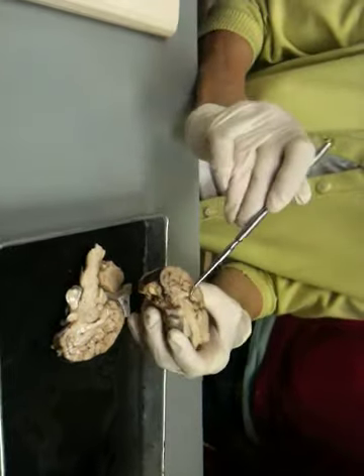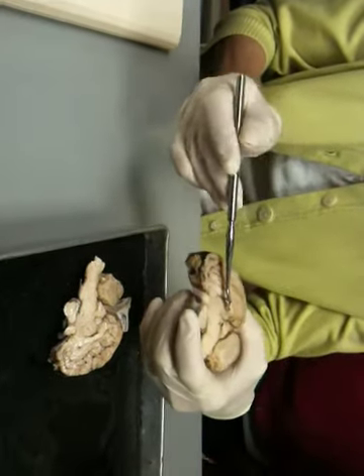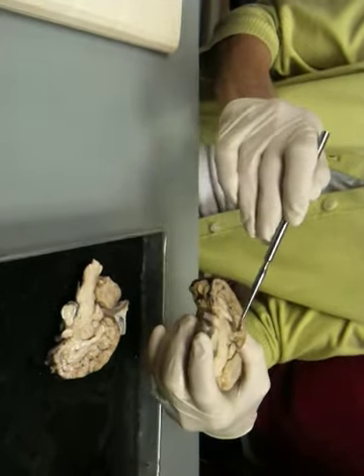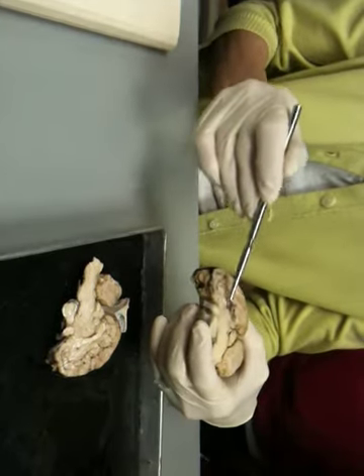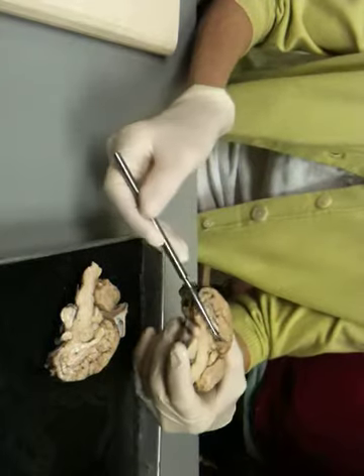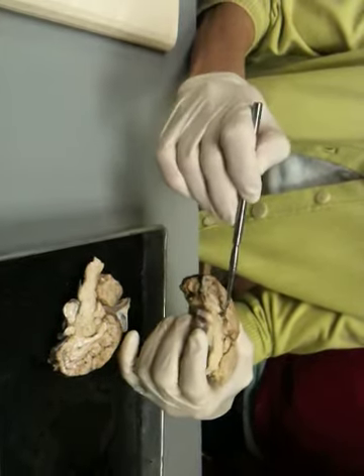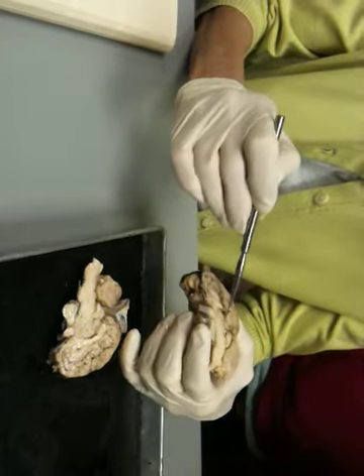Now this right here is a really good choroid plexus. You can see it really well. This is from the third ventricle. So the third ventricle is right in this area. It's in the diencephalon, but this is the roof of the third ventricle where the choroid plexus is. It looks like blood vessels, and that's what that is. Yeah, we'll put him back in there.